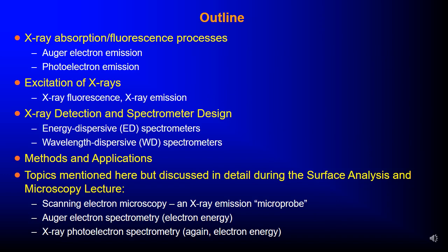So X-ray absorption processes, we have the Auger electron emission and photoelectron emission. Excitation of X-rays, we have X-ray fluorescence, then X-ray emission, then X-ray detection and spectrometer design. We look at energy-dispersive spectrometers and wavelength-dispersive spectrometers.